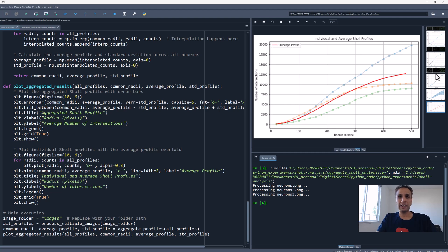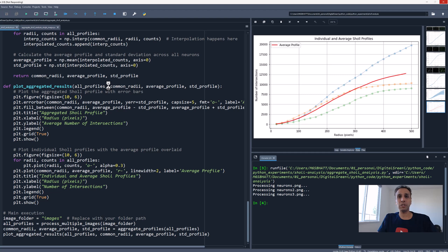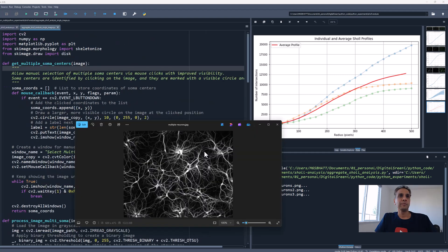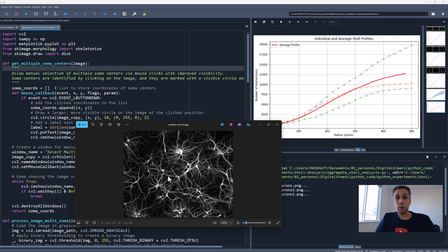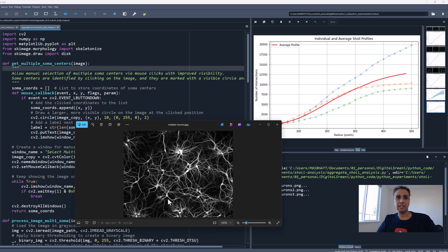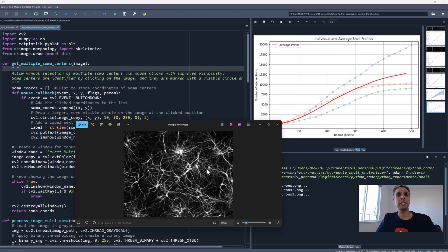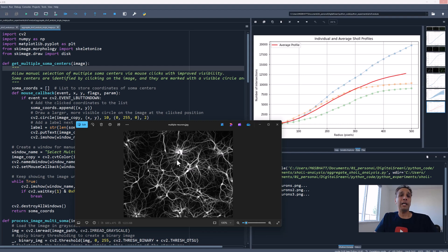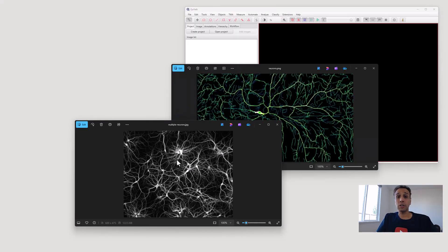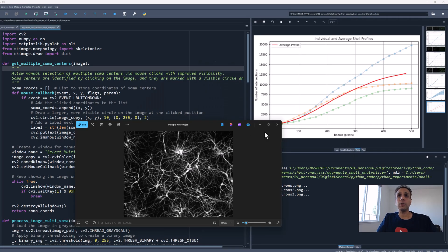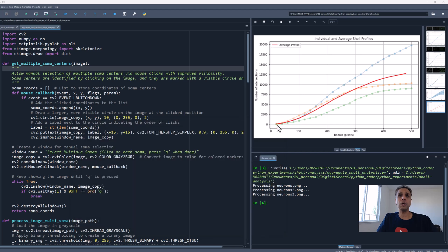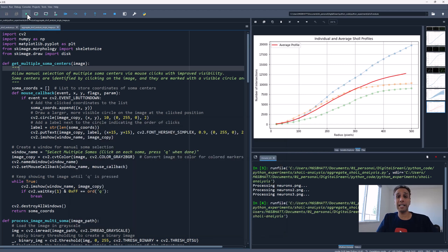I don't think it makes sense. Let's go ahead and cover that in this tutorial, which is what if you have a bunch of neurons in a single image. For example, I have this image where you see a whole bunch of neurons right there. How to perform this type of analysis? Now we need to select a whole bunch of these soma centers. Again, this is a 3D image. It'd be nice to do 3D analysis. I keep thinking about that. That should be one of my future videos. But with this image, let's focus on 2D. Let's not waste any more of your time.